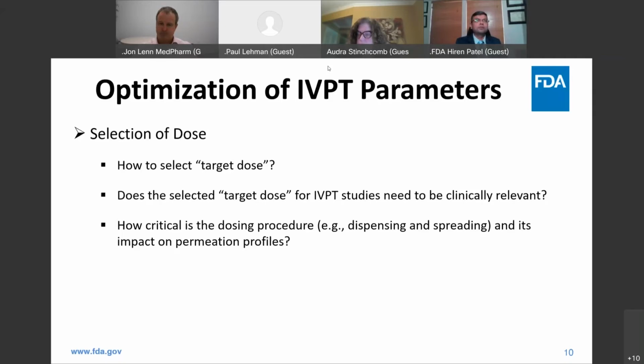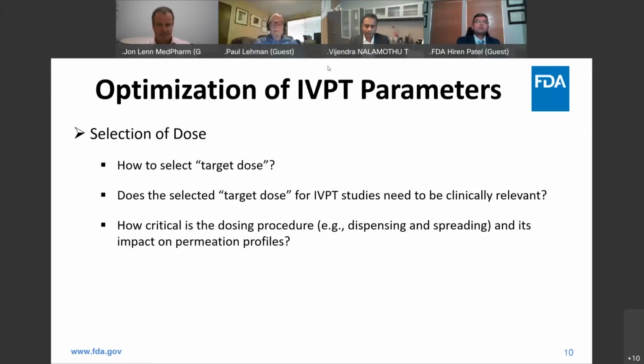Go ahead, Paul. Sorry. This may be the most critical variable of the entire process, the dosing process. Having well-trained staff, having staff being consistent, and having the same staff do every batch of skin within a study will help minimize variability in dose application.